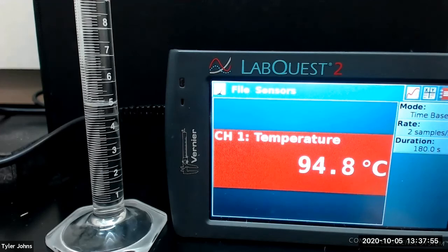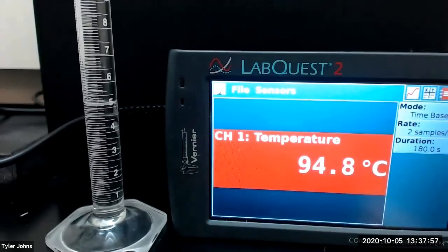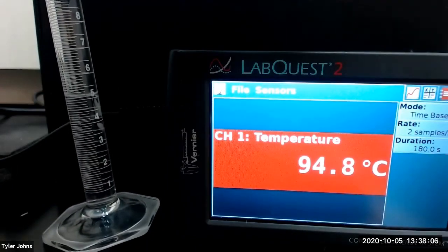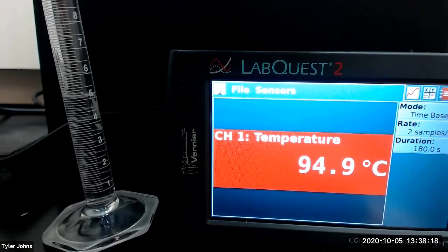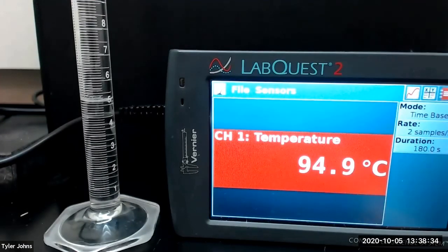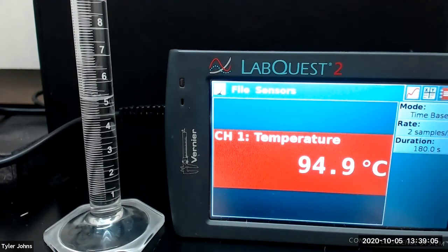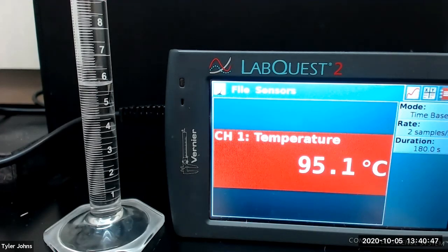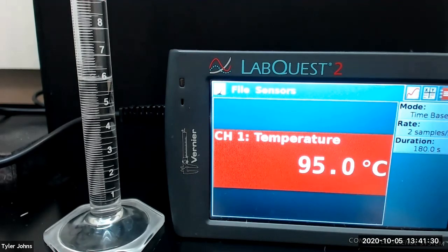We've collected five milliliters of distillate, so we'll now collect three to four drops in our GC vial.